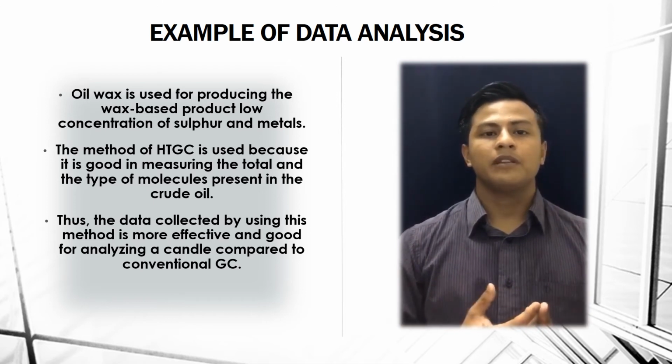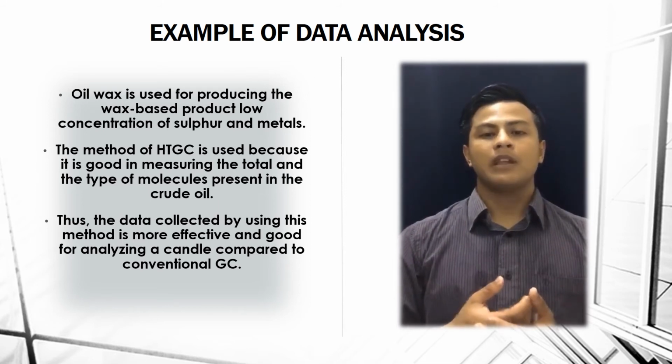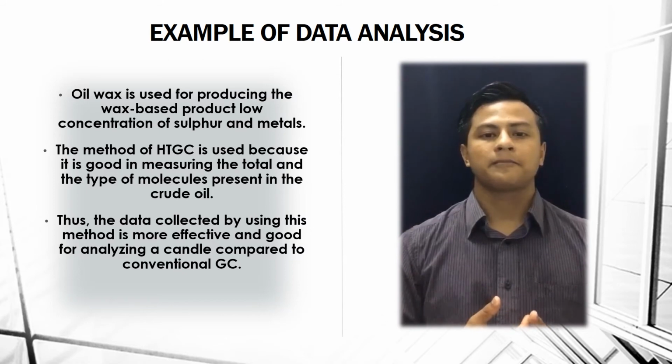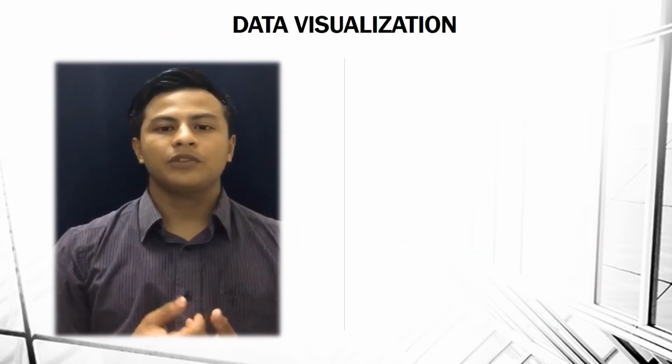So, I will explain three parts of the example of data analysis. The first part is data visualization, the second part is data processing, and the last part is data analysis. The first part is data visualization.